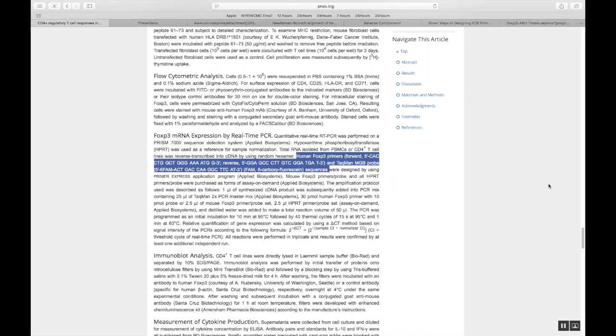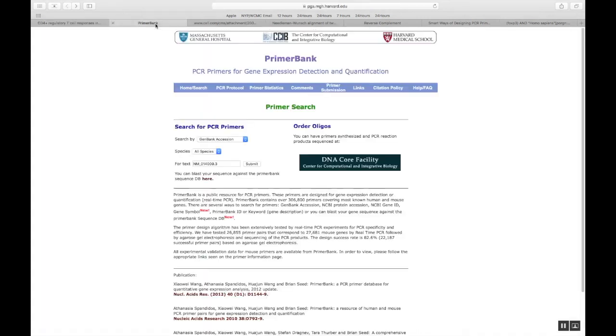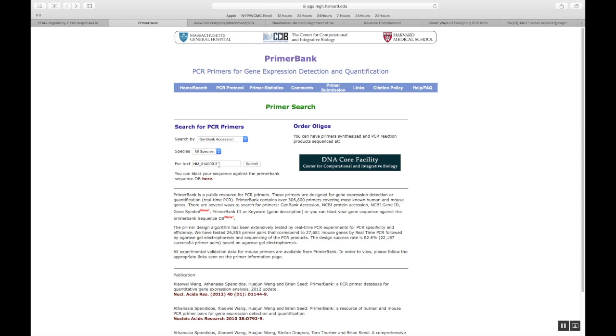What is another way of getting your probes and primers is going to Primer Bank. Primer Bank is by Mass General Hospital. You can see it's from Harvard Medical School, from Boston and it's quite a reliable source for your primers. Here what you do is you come here. All you have to do is give your accession number. How to get an accession number if you don't know, send me some questions regarding that.